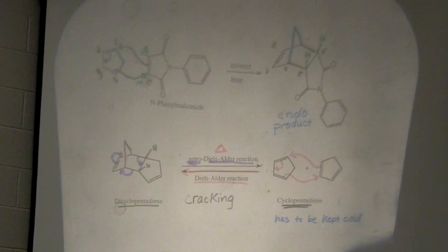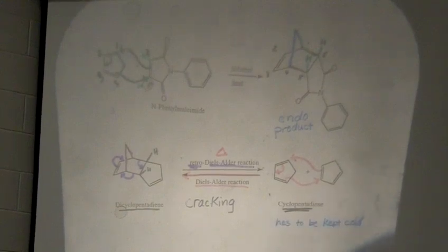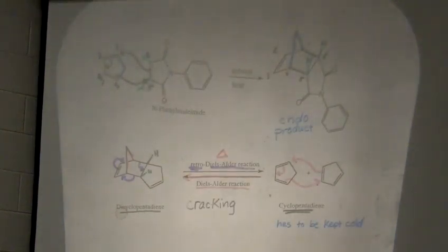If your solid does not dissolve, you most likely used the eluent for TLC. So I'm going to talk about that here in a minute. But the eluent for the TLC is 1:1 hexane to ethyl acetate. It will not dissolve your yellow solid, all right? So if your yellow solid will not dissolve, you've used the wrong thing most likely. It will only dissolve in straight ethyl acetate, all right? So watch labels because they look very, very similar to each other. Ethyl acetate versus 1-to-1 hexane to ethyl acetate. All right?